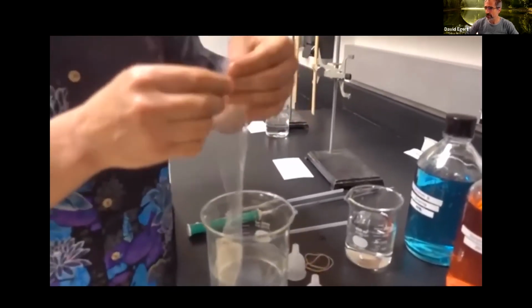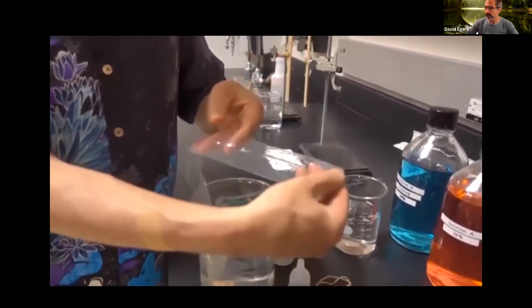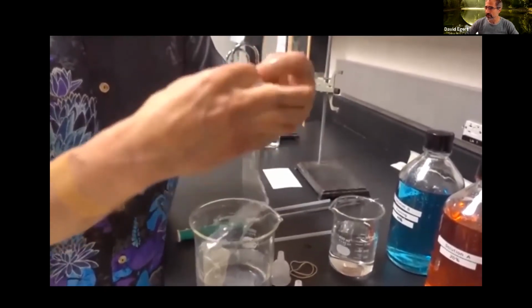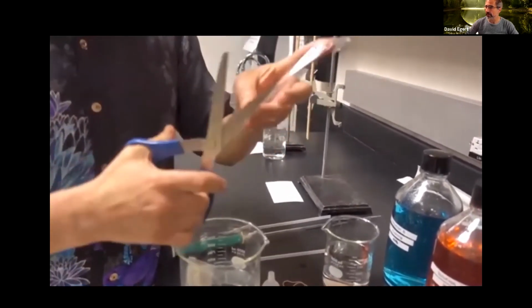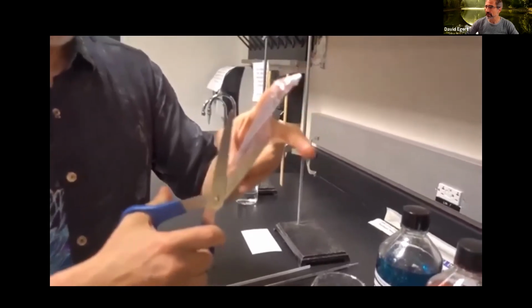This is called dialysis tubing. It looks like tape, but if you massage it between your fingers, it opens up and becomes a tube. Then we're going to take this tube and snip it across the bottom to make a smaller part, and up the side so we can open it up.